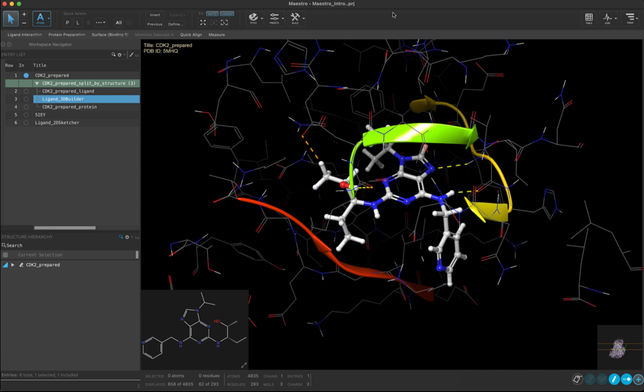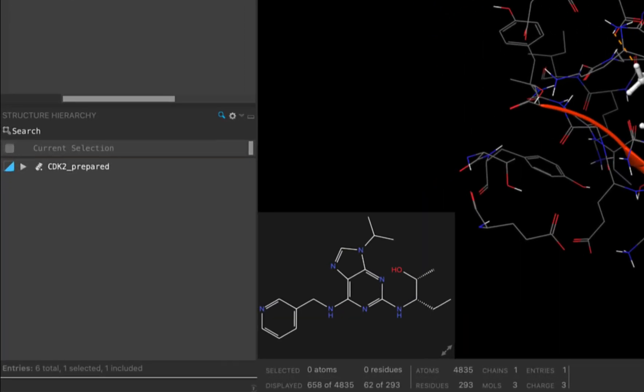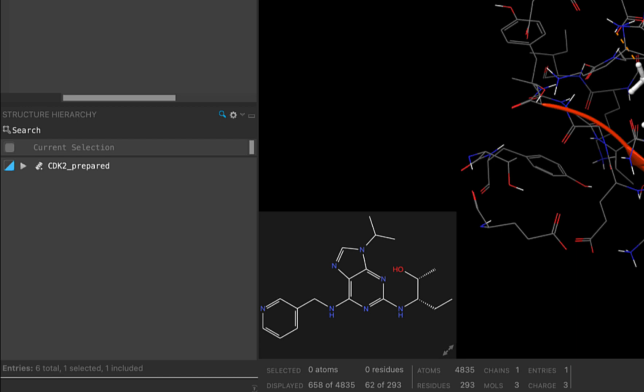Make sure to have your Maestro intro project open and your working directory set to your course folder. Before we begin, let's zoom out so we can see the whole entry.